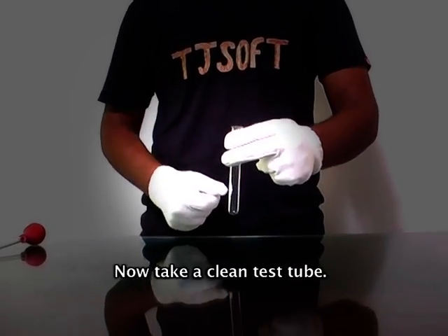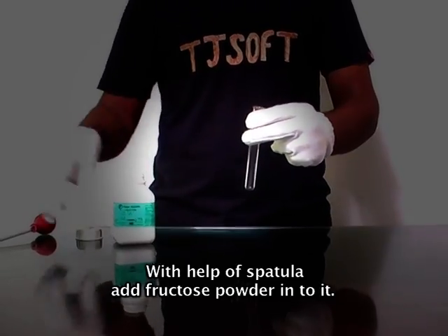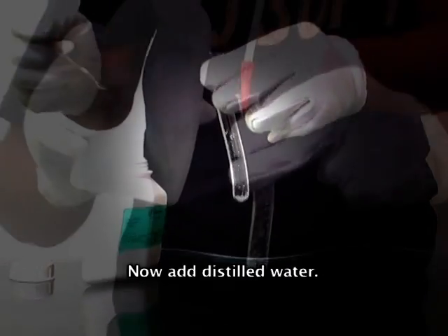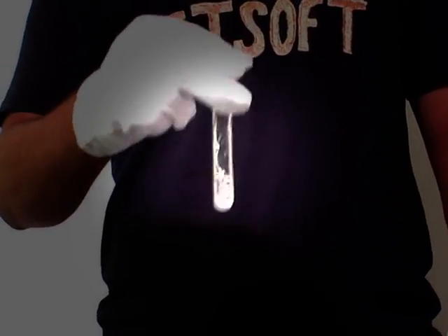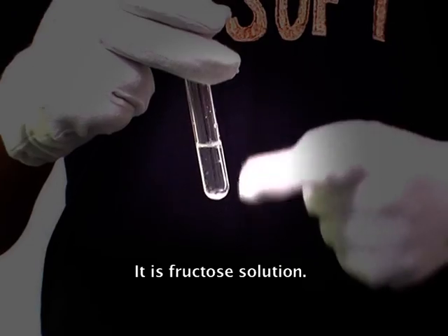Now take a clean test tube. With the help of a spatula, add fructose powder into it. Now add distilled water and shake it well. This is the fructose solution.